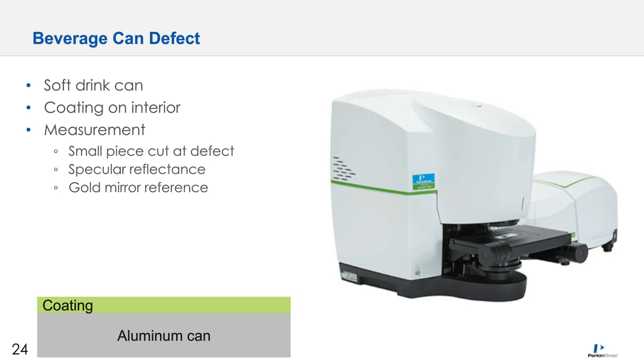The microscope actually picks up 2 beams of infrared light from the sample. A portion of the incident light is reflected by the surface of the coating, while some of the light passes through the coating, actually making 2 passes through the coating material. This is the transflectance phenomenon I referenced earlier, and this provides useful information as we'll see in the next slide.